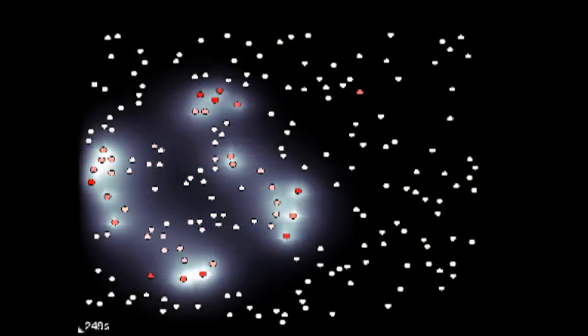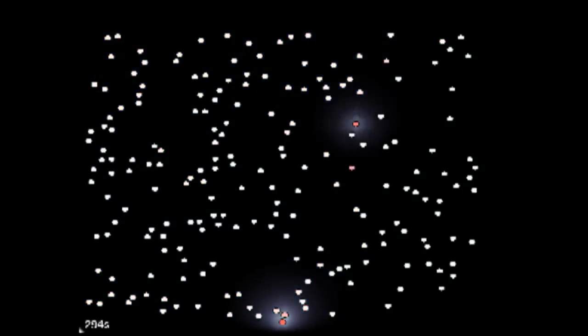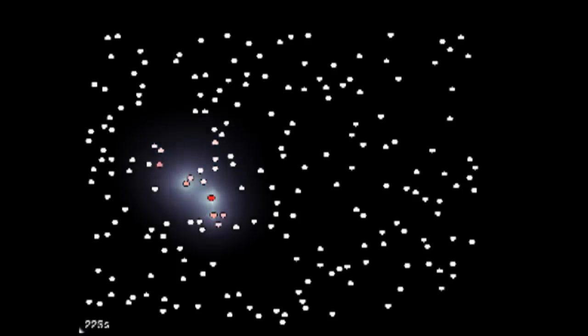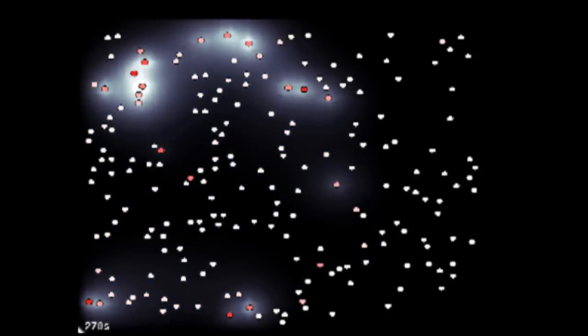Just to the left of the center, you'll see a wave nucleate after about 20 seconds of the movie, which is 240 seconds in the real time. The wave nucleates and forms and then spreads throughout the culture, much like what we see in the amyloid beta experimentally.